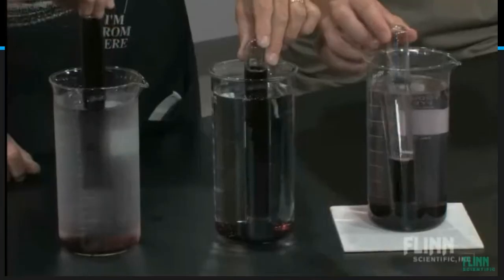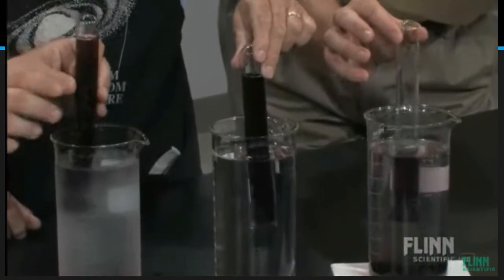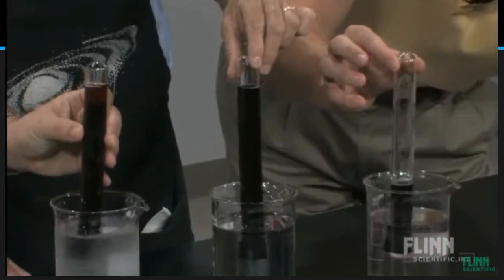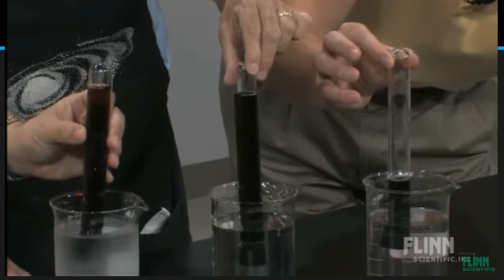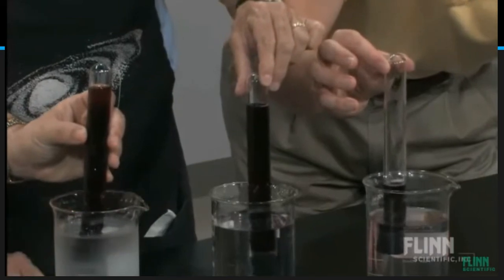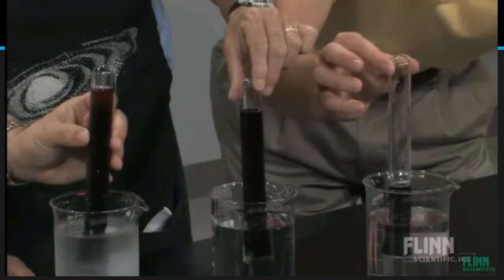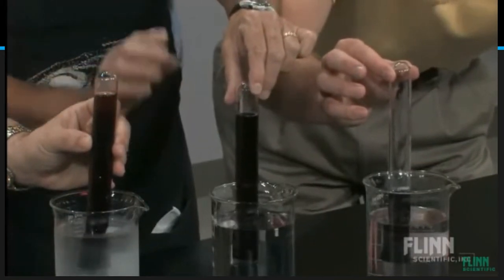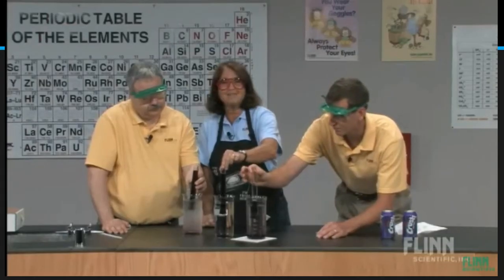Let's take our tubes. We're just going to hold them up at about the same level, but let's not remove them from underneath the surface of the liquid. And we can see that the level of the crush has gone down most in the hot water. Probably the room temperature water would be second. We had a real big start with the cold for some reason, but it's really slowed down, and the room temperature water has now got more of the pop removed. Try it with your classes.